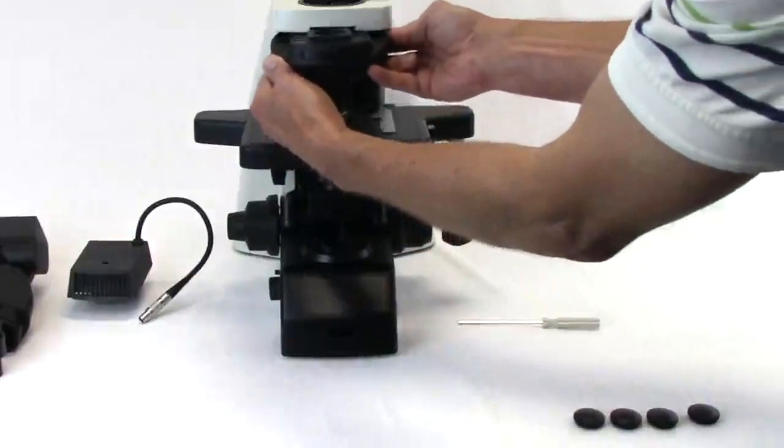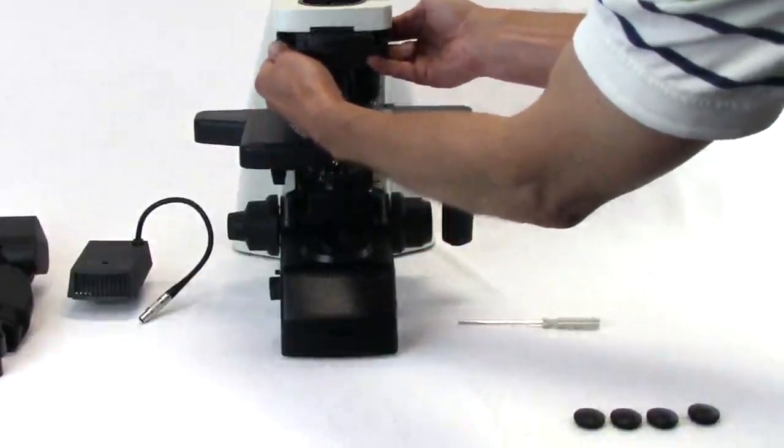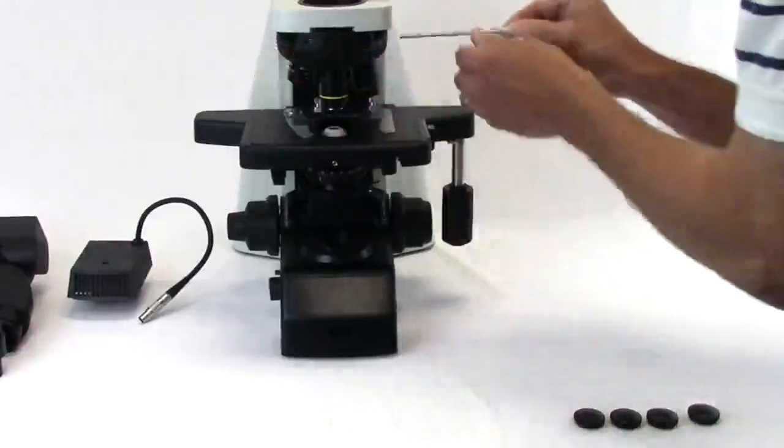Slide the nose piece back onto the dovetail mount on the microscope and retighten the lock screw with the hex wrench.